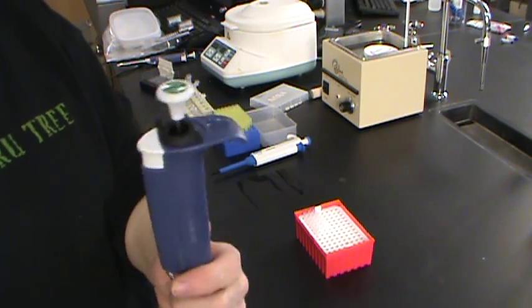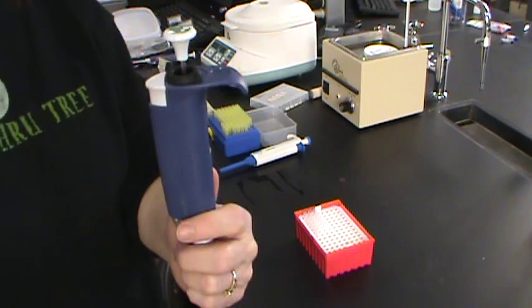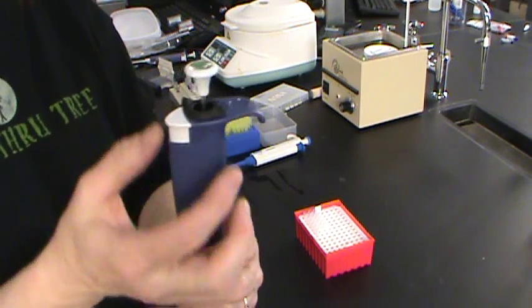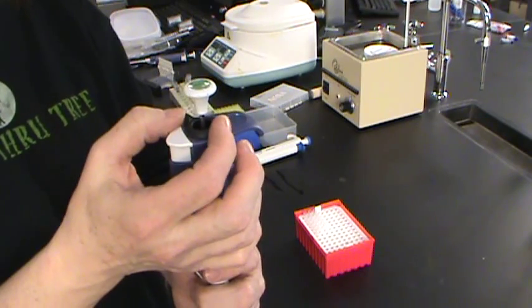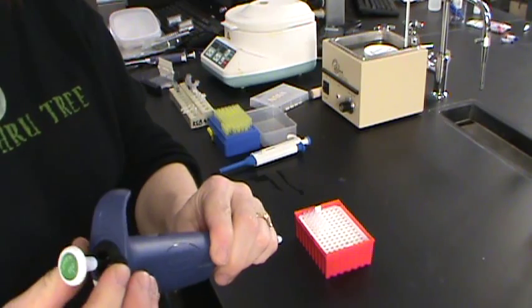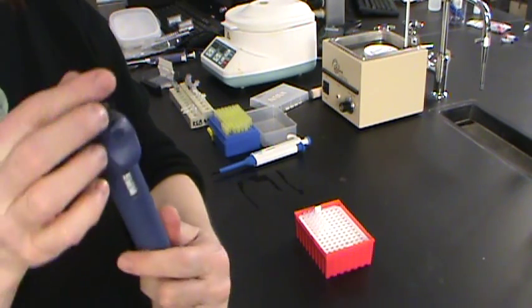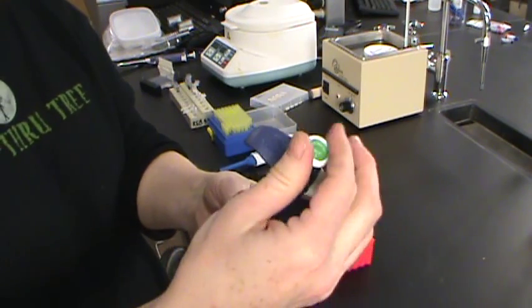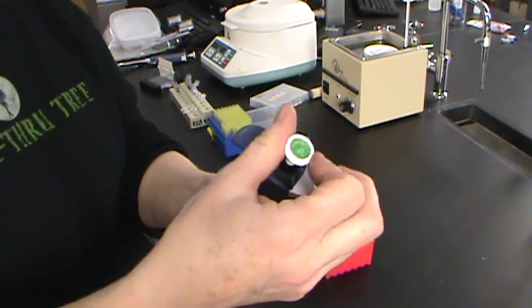So let's say that we want to measure a 20 microliter volume with this pipetter. First of all, we've got this little knob up here, and we'll make sure that that's loose so that we can turn the barrel to change our volume on here. And so we're going to change this to 20.